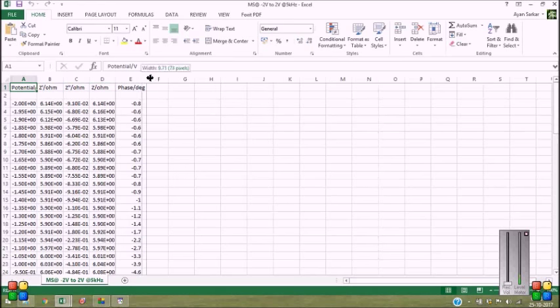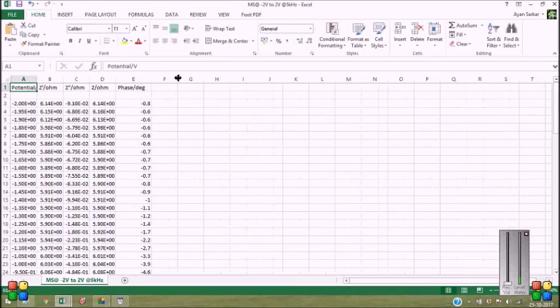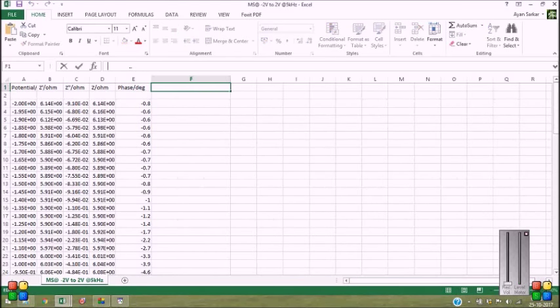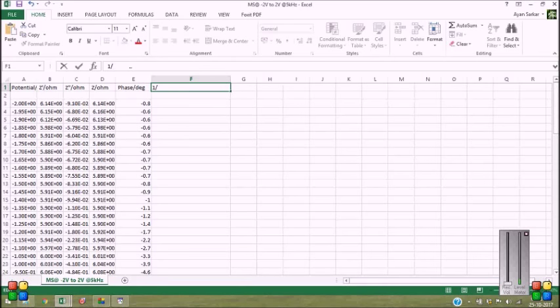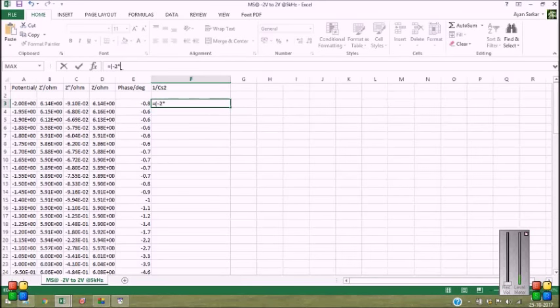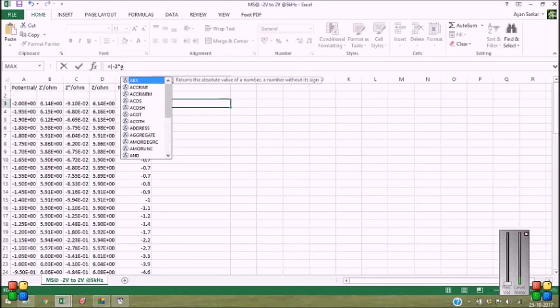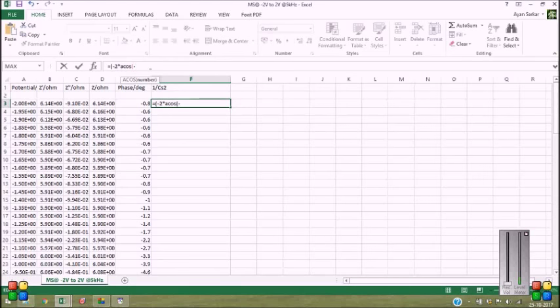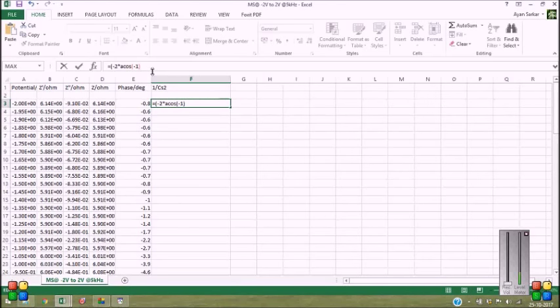Okay, so let me calculate using Excel. Excel is indeed a very good software for doing things like this. So one by Cs square, and I'm using the formula is minus 2π. For π, I am using the formula cosine inverse minus 1. You know that how to get π. In Fortran, we use this formula arccos cosine minus 1.